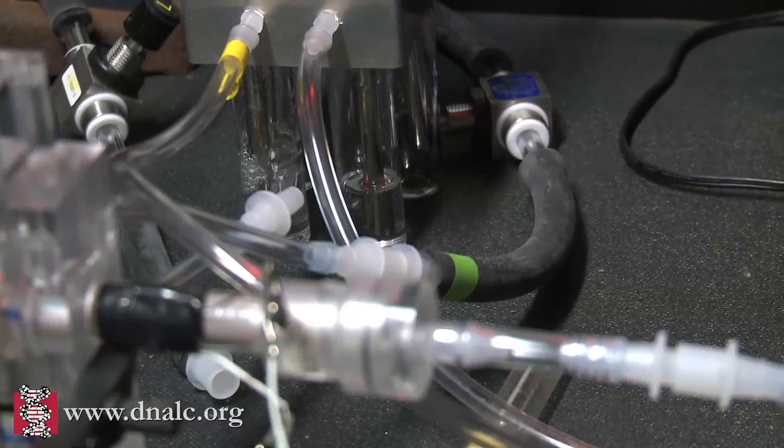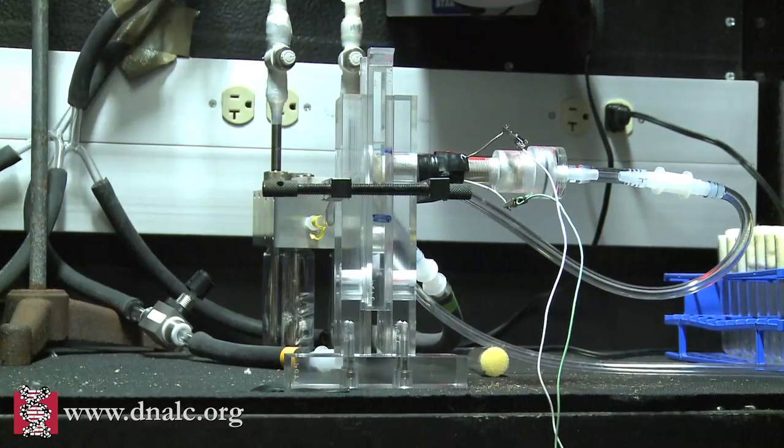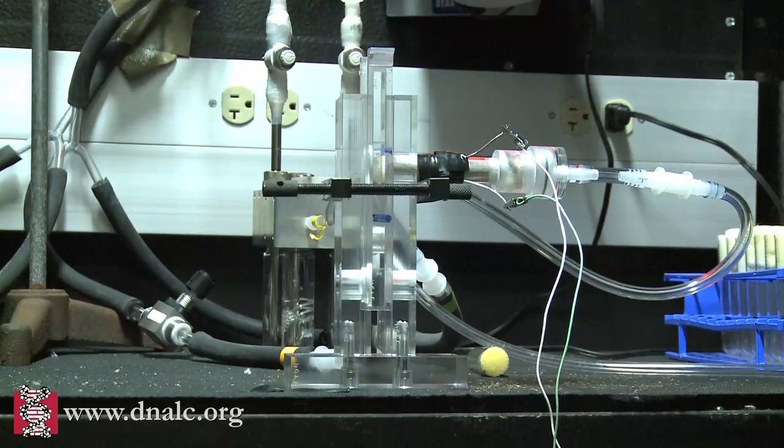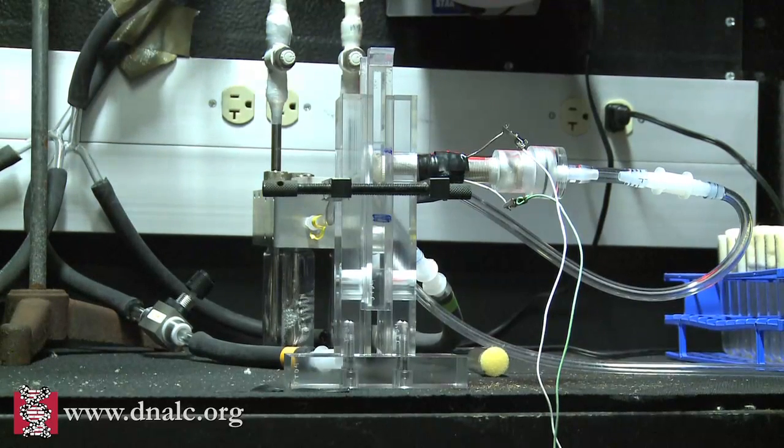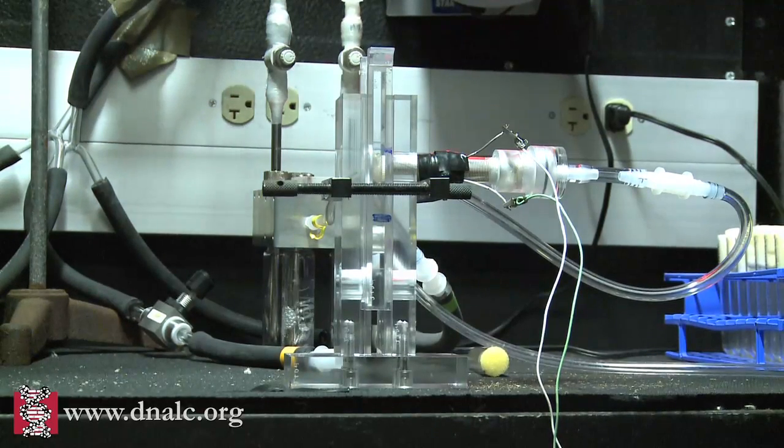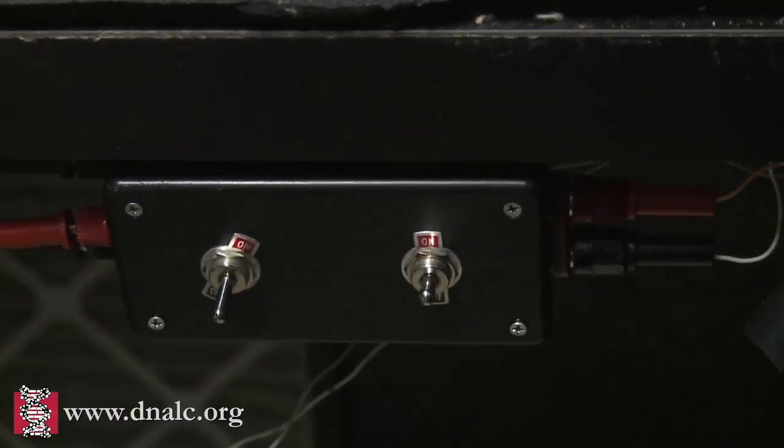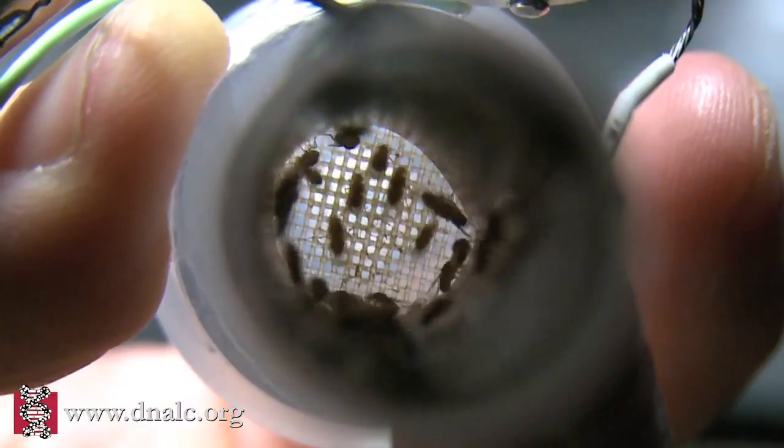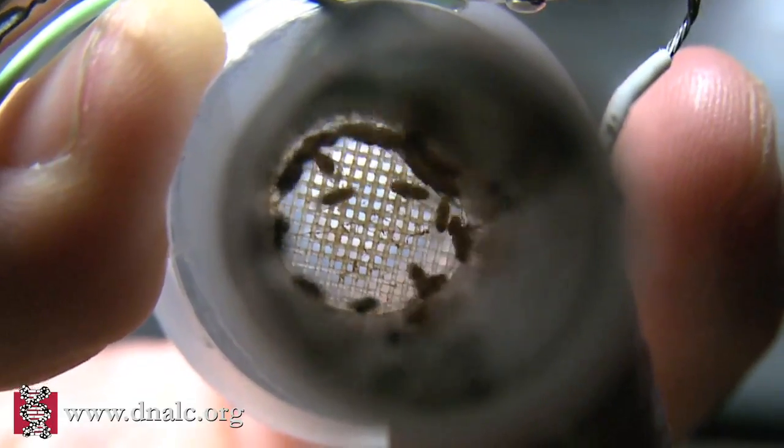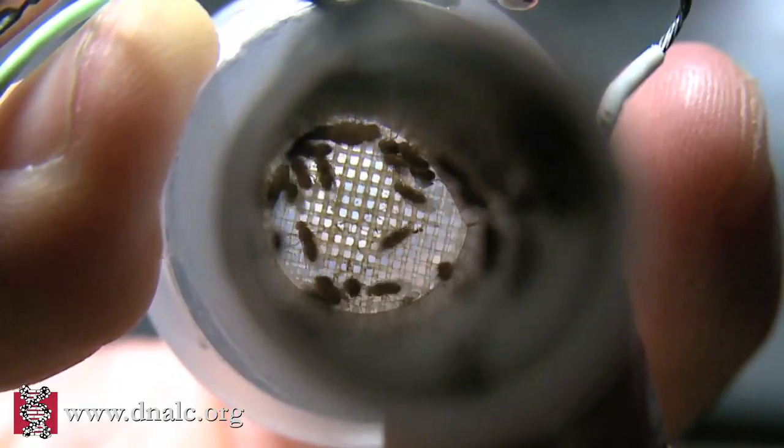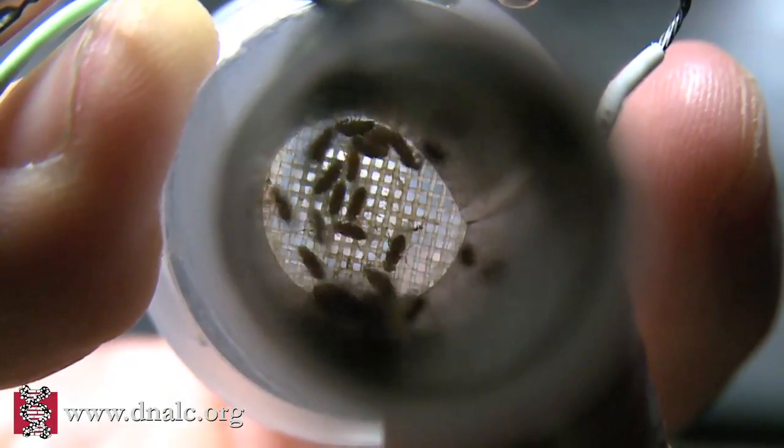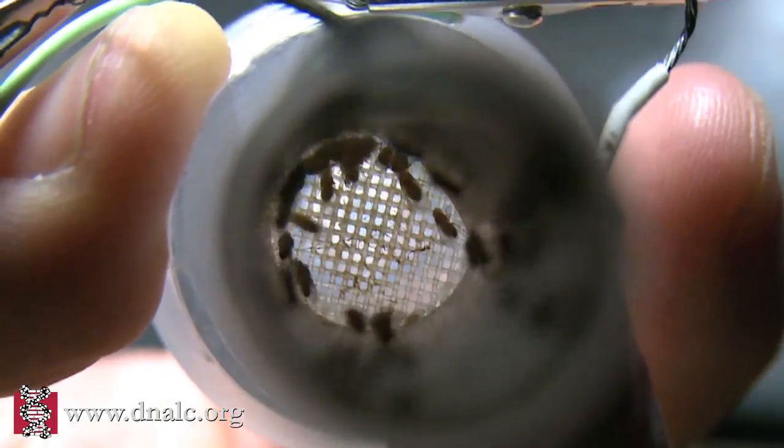The flies are sequentially exposed to one odor, OCT, which smells a little bit like licorice. While they smell the licorice-y smell of OCT, they receive an electric shock delivered through the wires. They don't like the electric shock—it's painful to them, and they jump whenever they feel it.